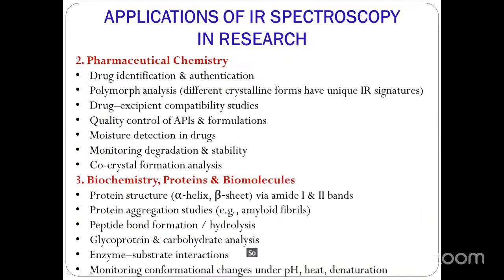We can employ IR spectroscopy in pharmaceutical chemistry for the identification of drugs, polymorph analysis, moisture detection, degradation and stability.